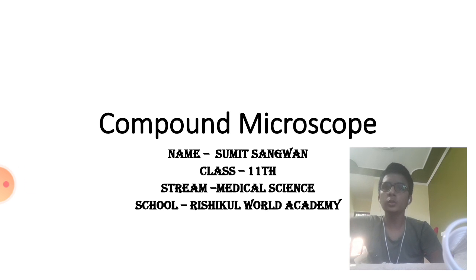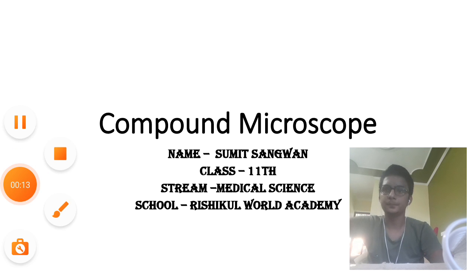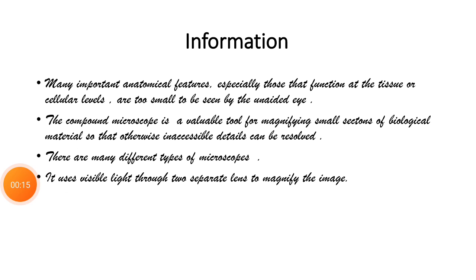Today I just want to increase your knowledge about the compound microscope a little bit. Let's start with some basic information regarding the compound microscope.